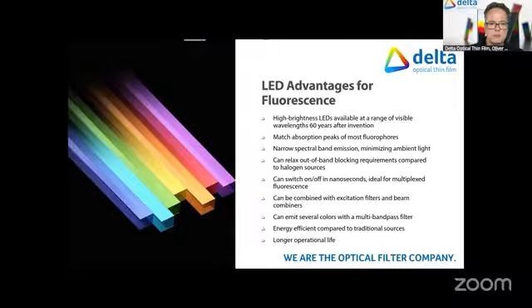And you can also combine them in a compact setup with excitation filters and beam combiners to make a very compact tunable light source. And if you have a multi-bandpass filter, you can use them to switch on and off for multiplex measurements several LEDs sequentially. And also compared to traditional light sources, they're very energy efficient and have a very long operational lifetime.